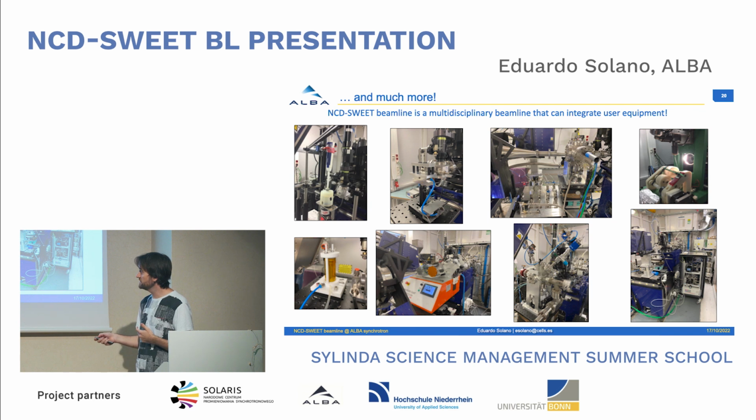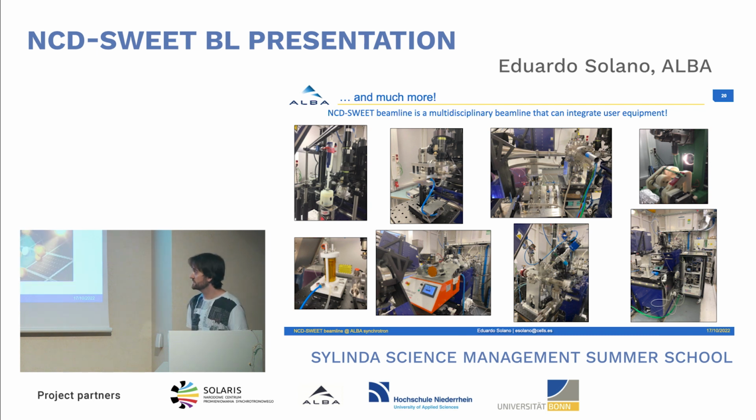So you inject the pellets here, and then you collect the roll of polymer here. So with SAXS and WAXS and GWAXS, we were able to get information of the polymer all along the production chain. So this was very, very nice. And this is an atomic layer deposition system, or this is a superconducting material growth system. So we can do a lot of things.